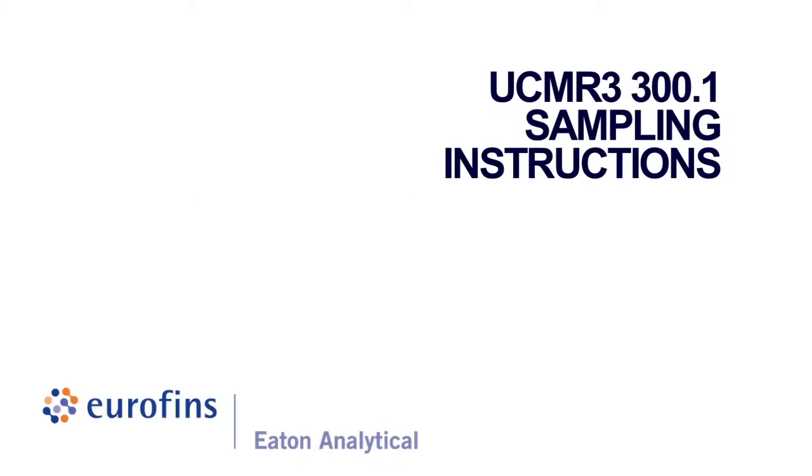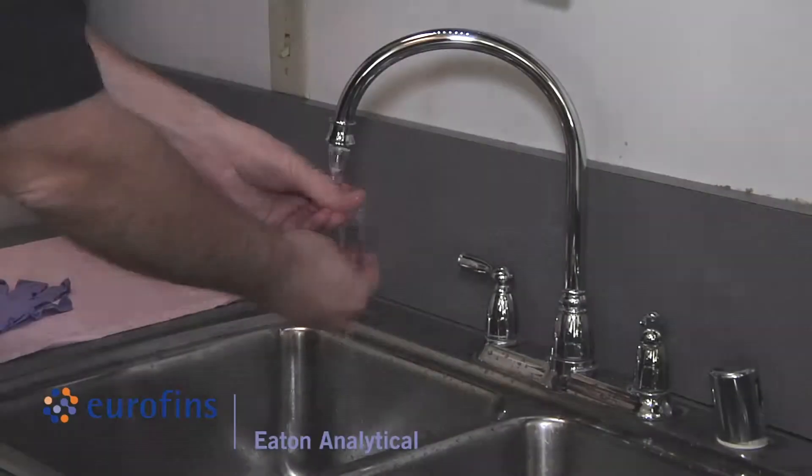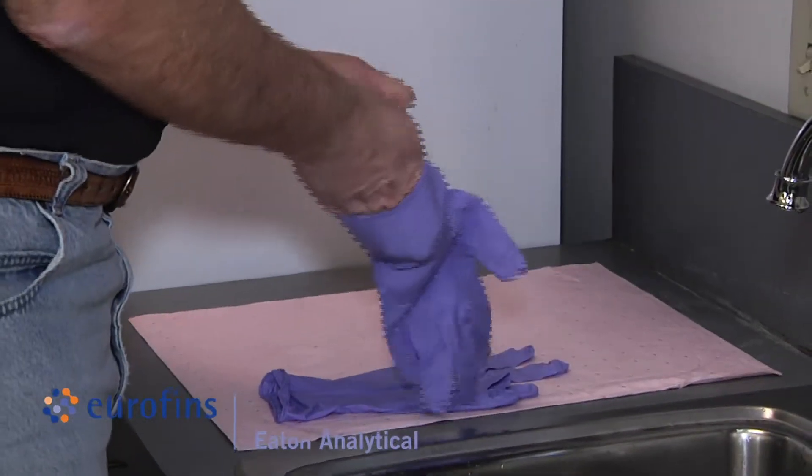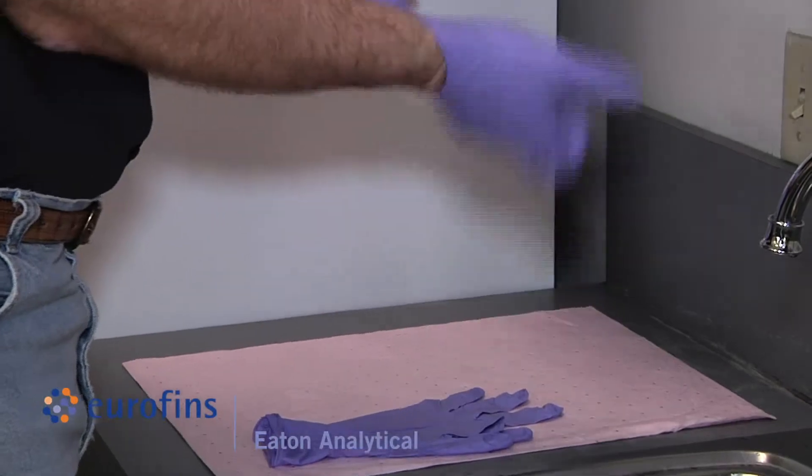UCMR3 300.1 sampling instructions. Wash your hands before sampling and wear the powderless nitrile gloves which are included in the kit during sampling and sample handling.